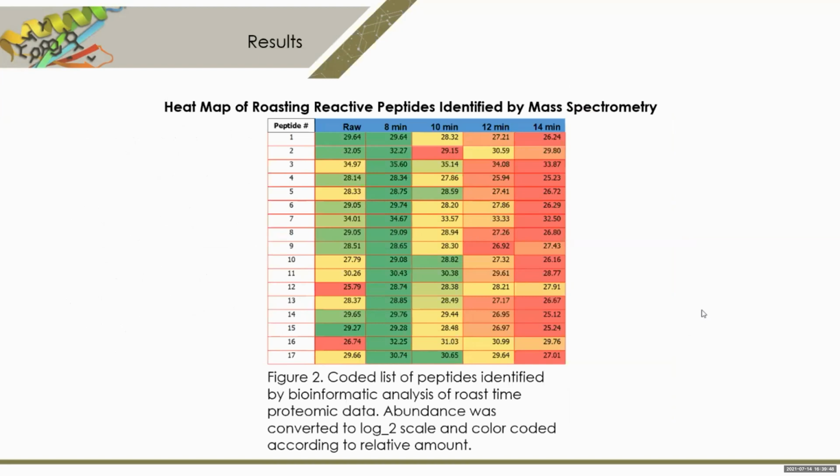And what we believe to be happening here is that this initial heating event helps the protein unfold and exposes more parts to the tryptic digest in this case. Then, as that protein was exposed, as time of roasting increased, more and more of the protein could react. So, in other words, first the proteins unfold, then amino acids on that peptide reacted, and the parent peptide was eventually completely broken down into flavor compounds.